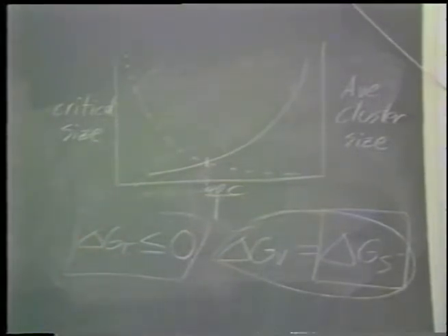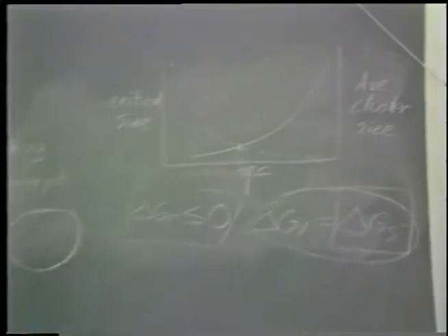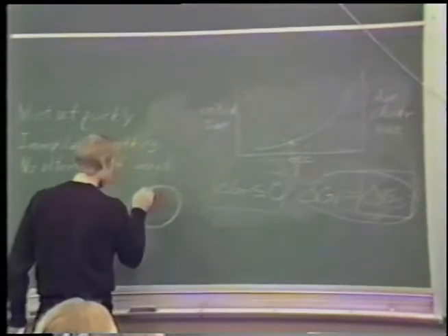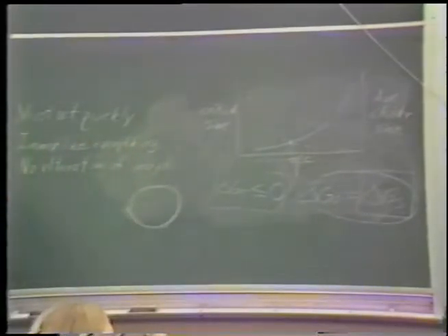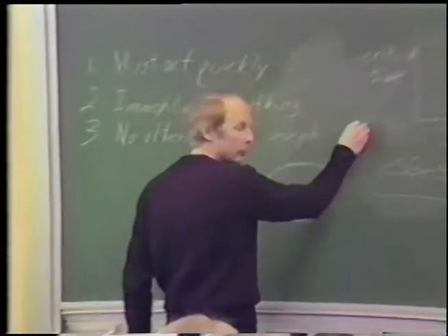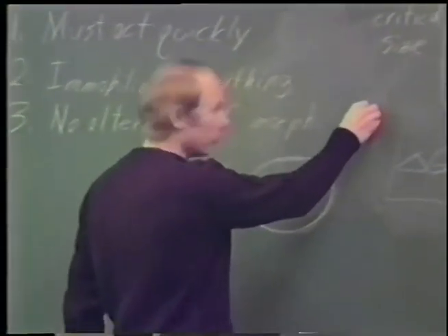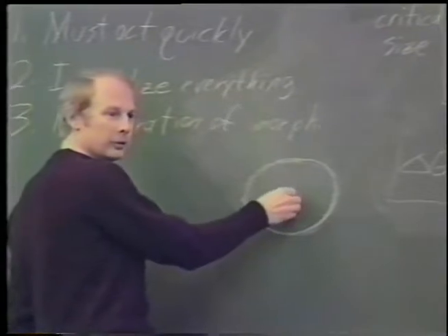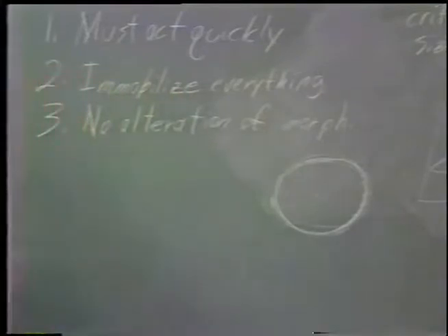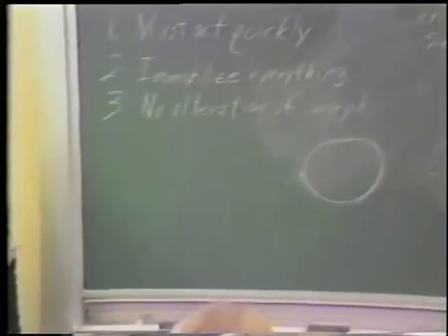Now, it has been postulated that at this interface between the cluster and the still aqueous medium, the surface layer is actually a separate phase. There are systems in which this is true. There are two component systems in which one component is suspended in the other. This is one phase, the bulk solution the suspension is in. This is another phase, the interior of whatever is suspended. And this is the third phase. It's not known that it's true for water, so someone has simply postulated it.